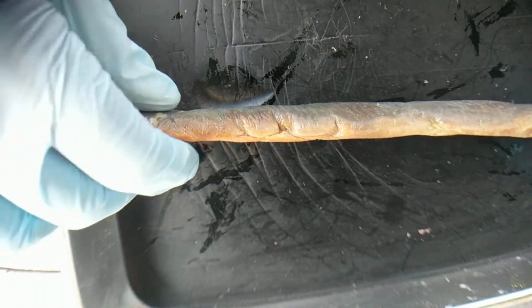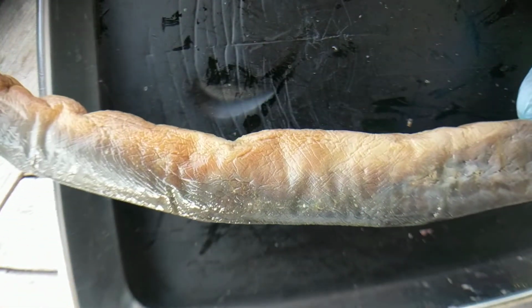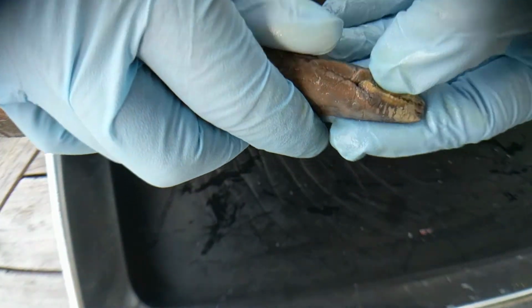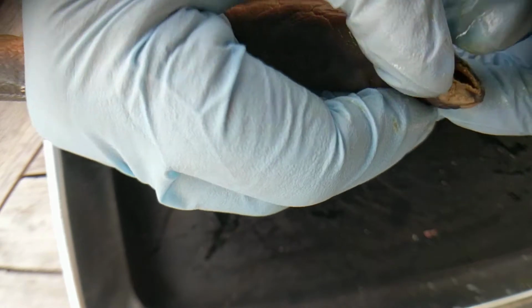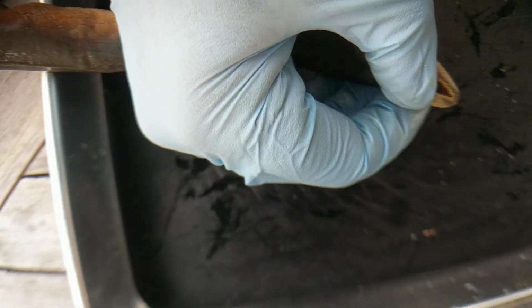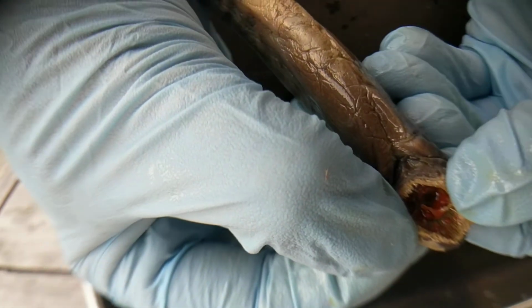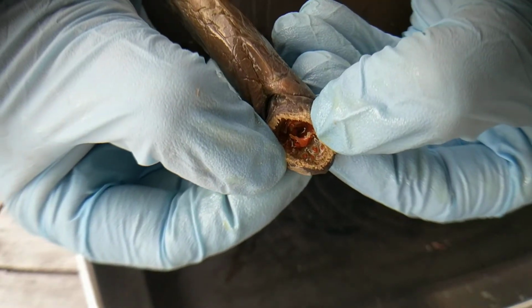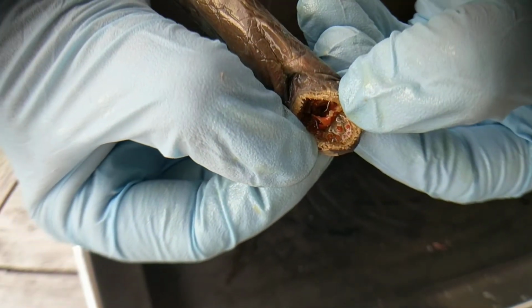Okay, so let's see, we have the caudal fin, dorsal fin, trunk, the urogenital papilla, external gill slits, the buccal funnel. So the mouth area is called the buccal funnel. Buccal refers to mouth, and there are teeth in there. I'm not sure if we can see them. All right, let's see if I can get close enough so you can see the teeth. We may have to dissect out a little bit, but you can kind of see those little red spots in there. Those are the teeth.